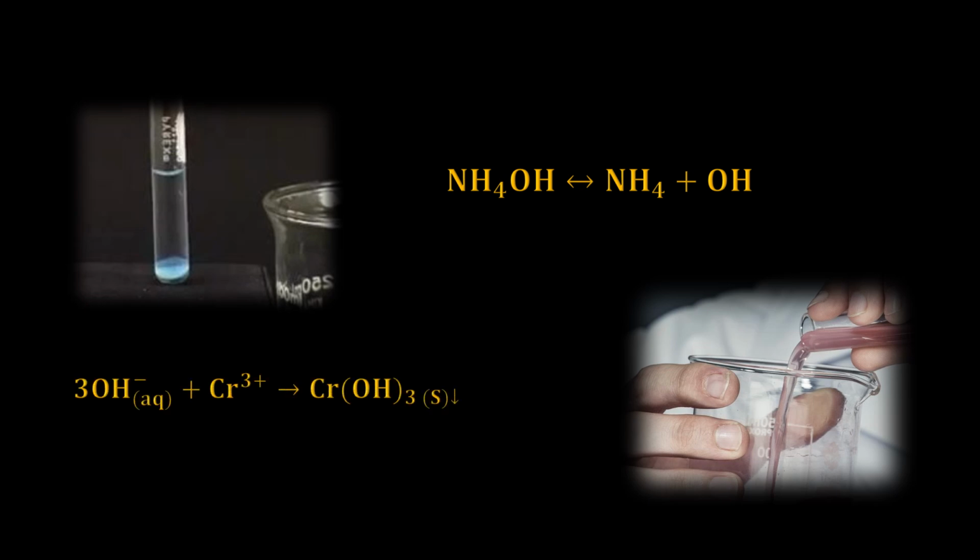Adding ammonium hydroxide will precipitate the hydroxides. The ammonium hydroxide will dissociate into ammonium ions and hydroxide ions. The hydroxide ion concentration will not be sufficient, because the ammonium ion is the common ion. The ionization of the ammonium hydroxide will be limited and the hydroxide ion will be reduced. Any compound with a large Ksp value will not precipitate and will remain in solution. All elemental compounds in the group 3 group have lower Ksp values and therefore will precipitate as hydroxides and oxides as the hydroxide is reduced.